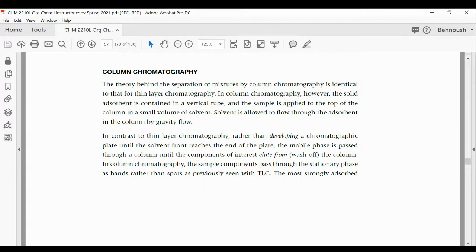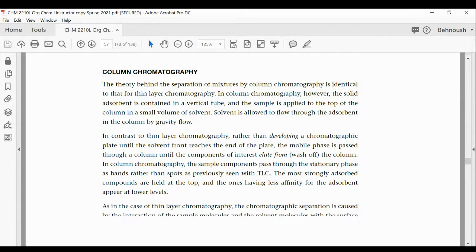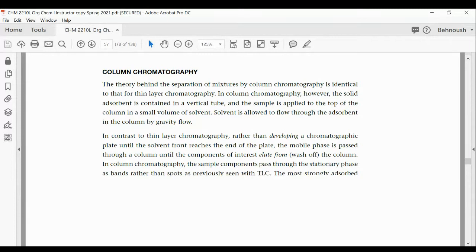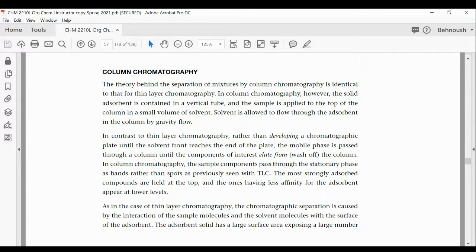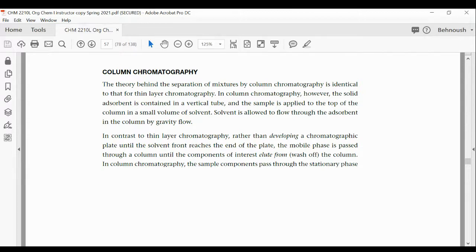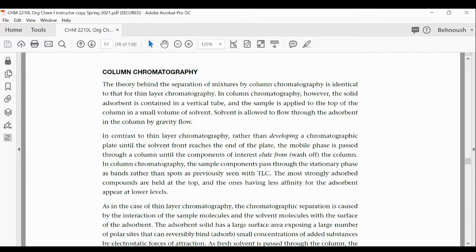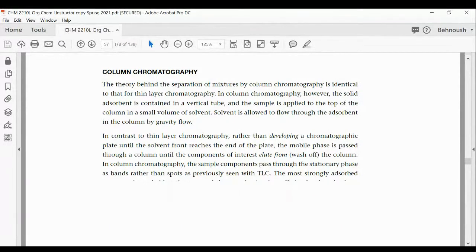The coil is specifically called the column in chromatography. So you have the gas chromatography. From the injection to the receiving part, it takes different times, and that time is called retention time: how long your sample stayed inside the column. Retention time is different from one compound to another, so if you know the retention time for a specific compound, you can identify an unknown by matching the numbers.